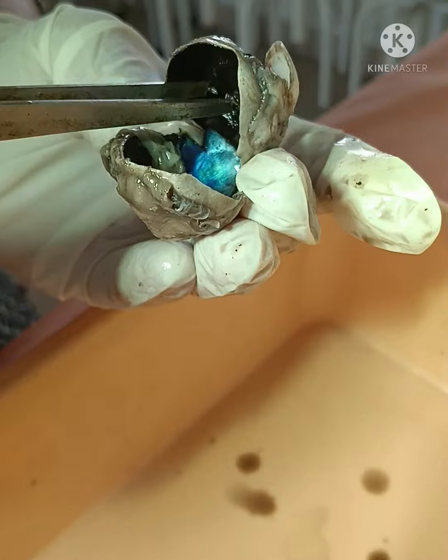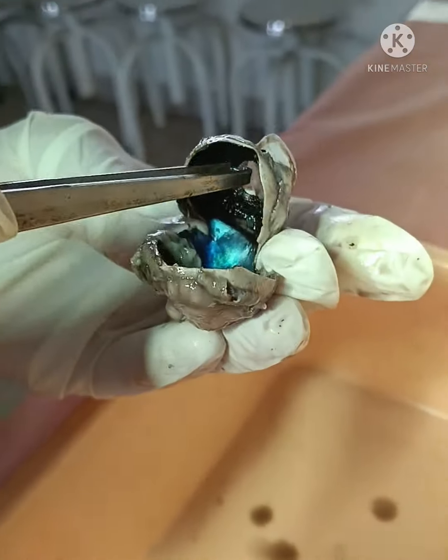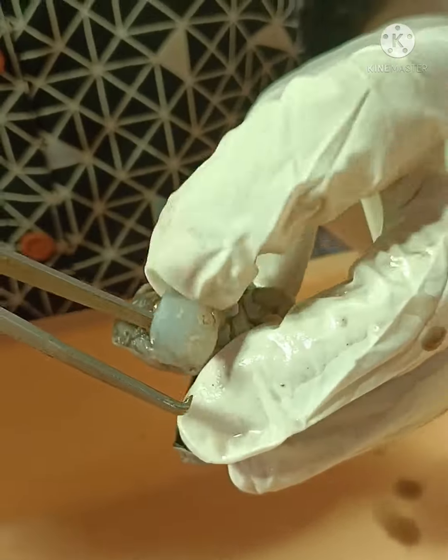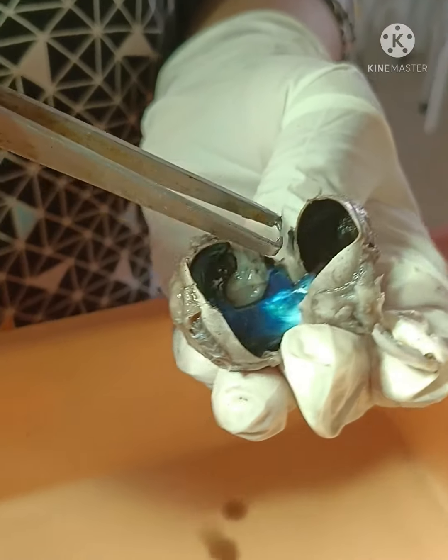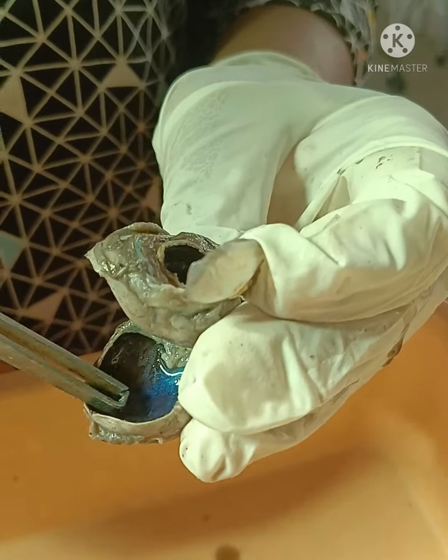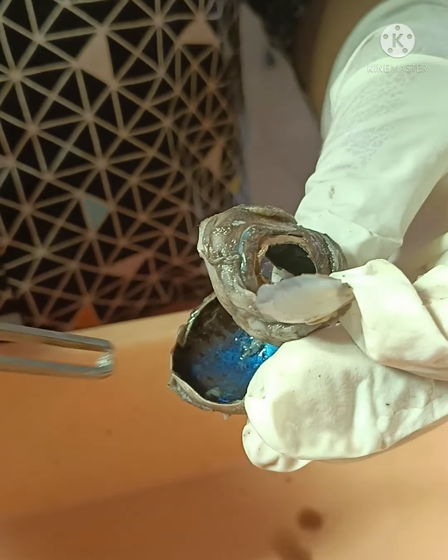The ciliary body is also dark in color, due to the presence of melanin pigment, and it is responsible for production of the aqueous humor. The refractive media include the cornea, the anterior chamber, the posterior chamber, the lens, and then the vitreous body. So the light rays enter from the cornea and reach the internal layer, which we call the nervous layer, the retina.